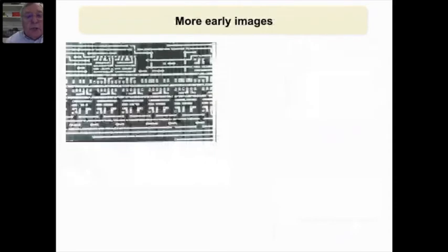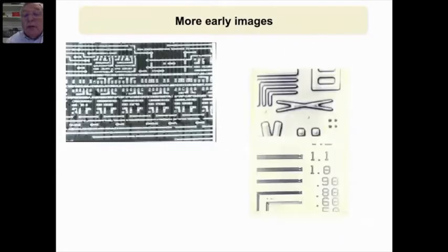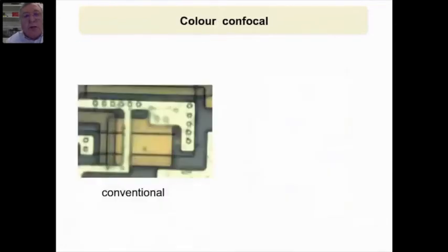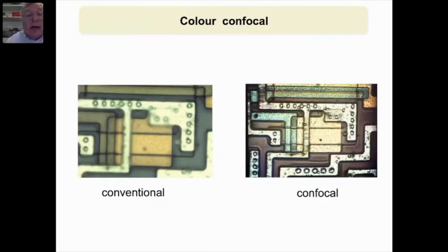And we got a bit better, and here are some images of a fairly low resolution microcircuit, some resolution test specimen, and the ever-present diatom showing that it actually does work. Interestingly, one of the earlier things people were interested in was color confocal. And here's a conventional image and the confocal equivalent.